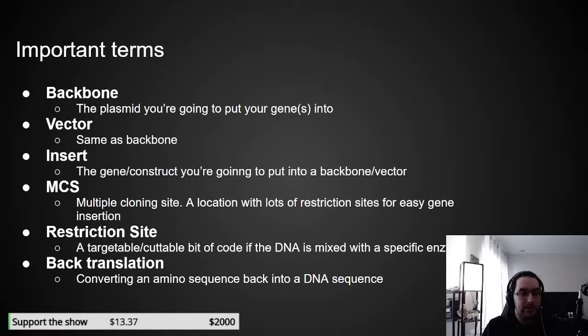And then you take that DNA mixture and you run it on a gel, and it'll separate the DNA into a series of bands. And if the bands show up on the gel in the right order and they're the right sizes, then you can already have an idea that you've put your DNA together correctly. So this is a very helpful thing to know.